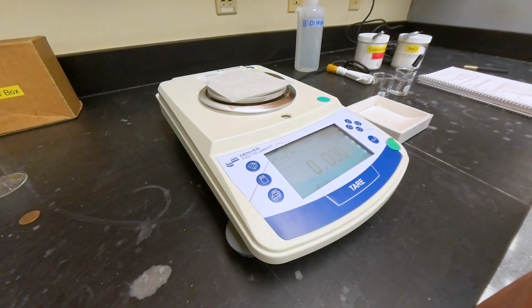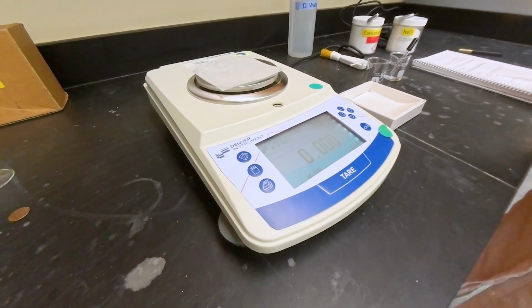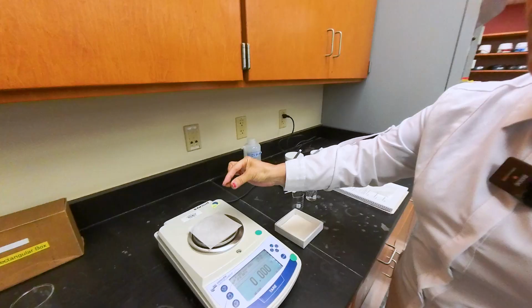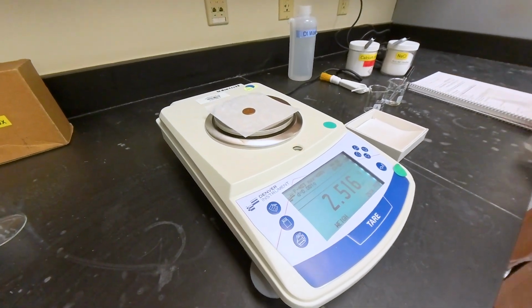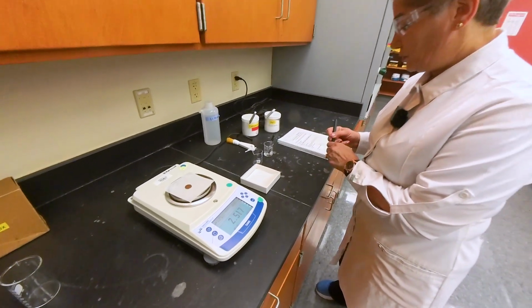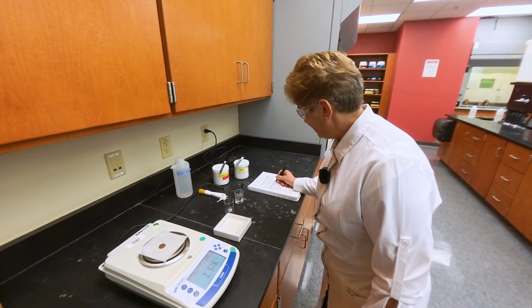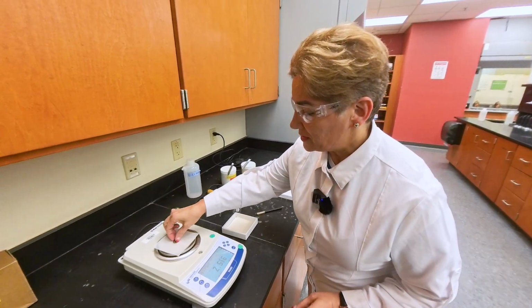When you look at the data sheet, the first item we are measuring is a single penny. I take the single penny and place it on the weighing paper and wait for the mass to stabilize, and I record that number, and I want you to record that number. Watch it carefully and record the number with all decimal places provided by this scale. And that's it. You remove the single penny.